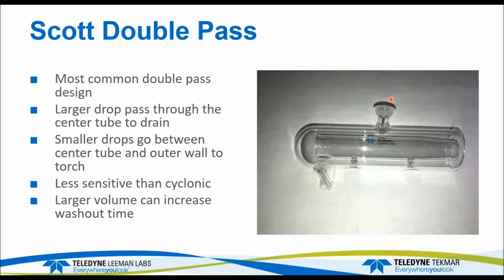And that really, for us, was dealing with that to do sort of high-speed wear metal analysis is one of the reasons we started using the cyclonics back in the sort of mid-90s when they first started appearing. And we pretty much switched over where the cyclonic is now the spray chamber of choice.